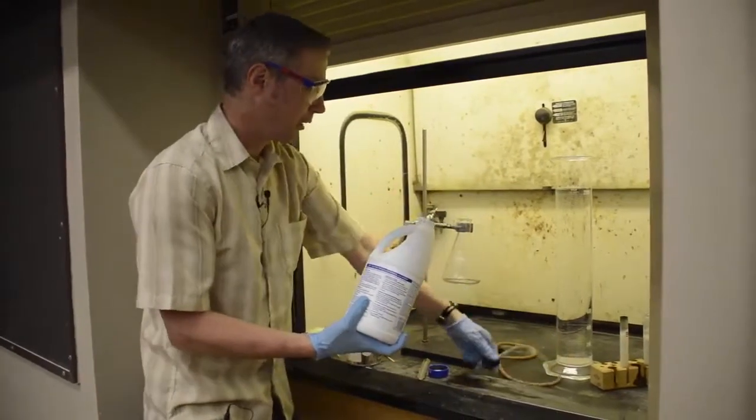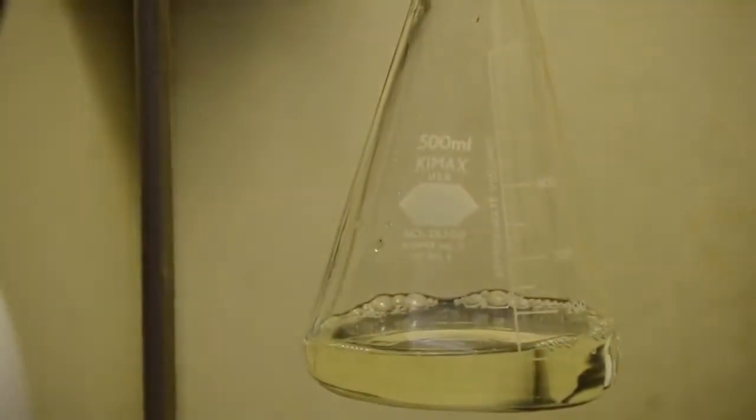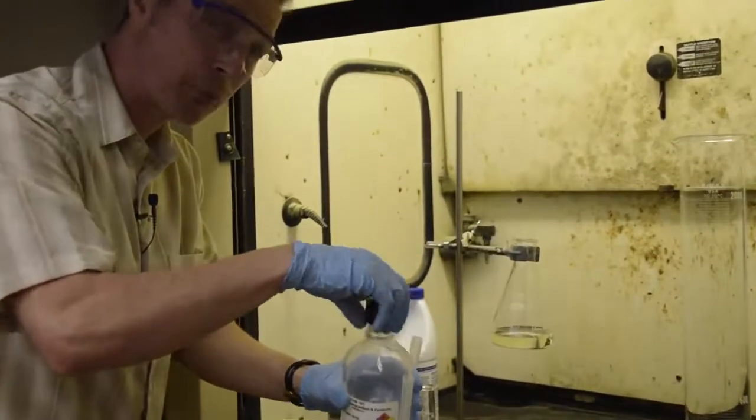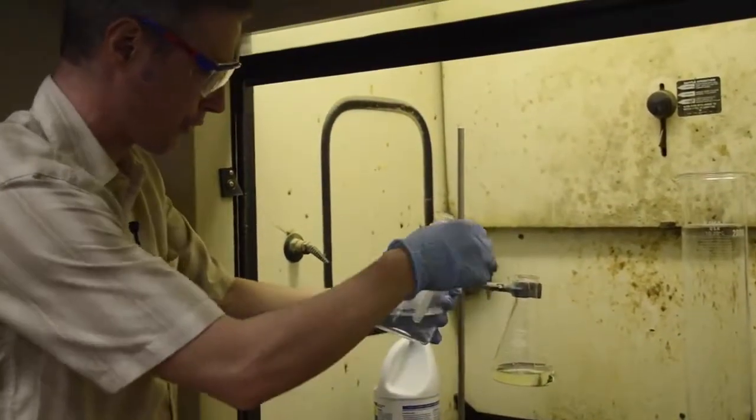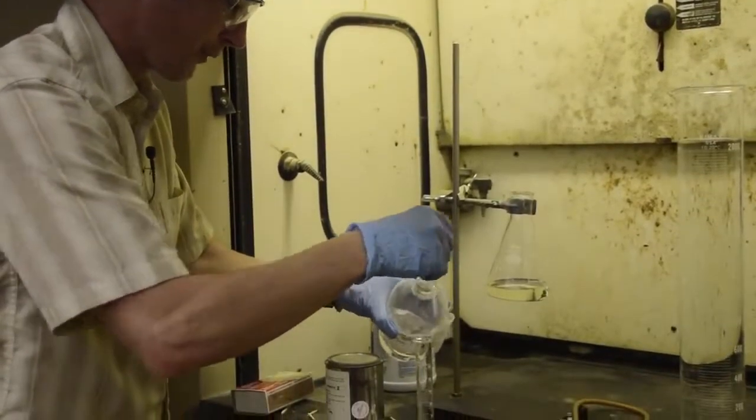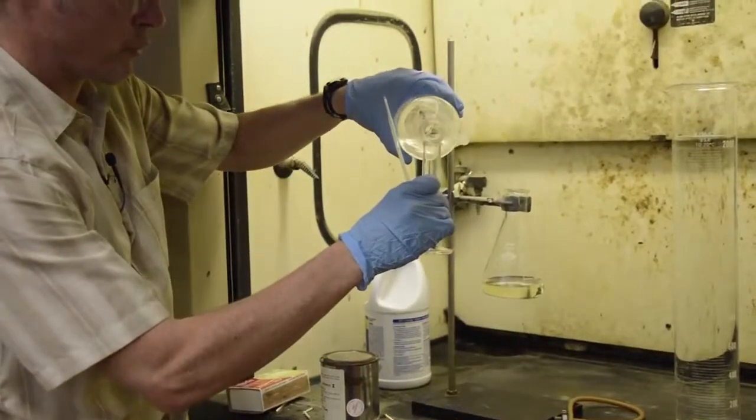I've got an Erlenmeyer flask, and I'm going to take about 100 milliliters of bleach. Then I'm going to add about 10 milliliters of hydrochloric acid. This is pretty strong hydrochloric acid, six moles per liter, which is about 60 times the strength of your stomach acid.